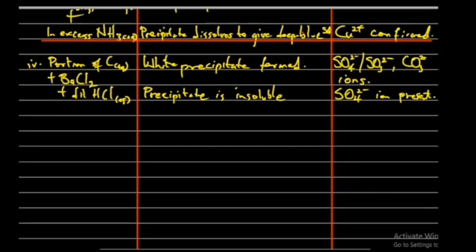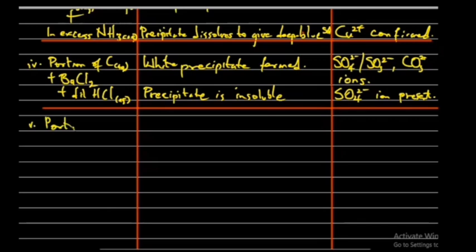Okay, let's see where we added our hydrochloric acid first. When we add our hydrochloric acid first, what we observed was that there was no visible reaction.